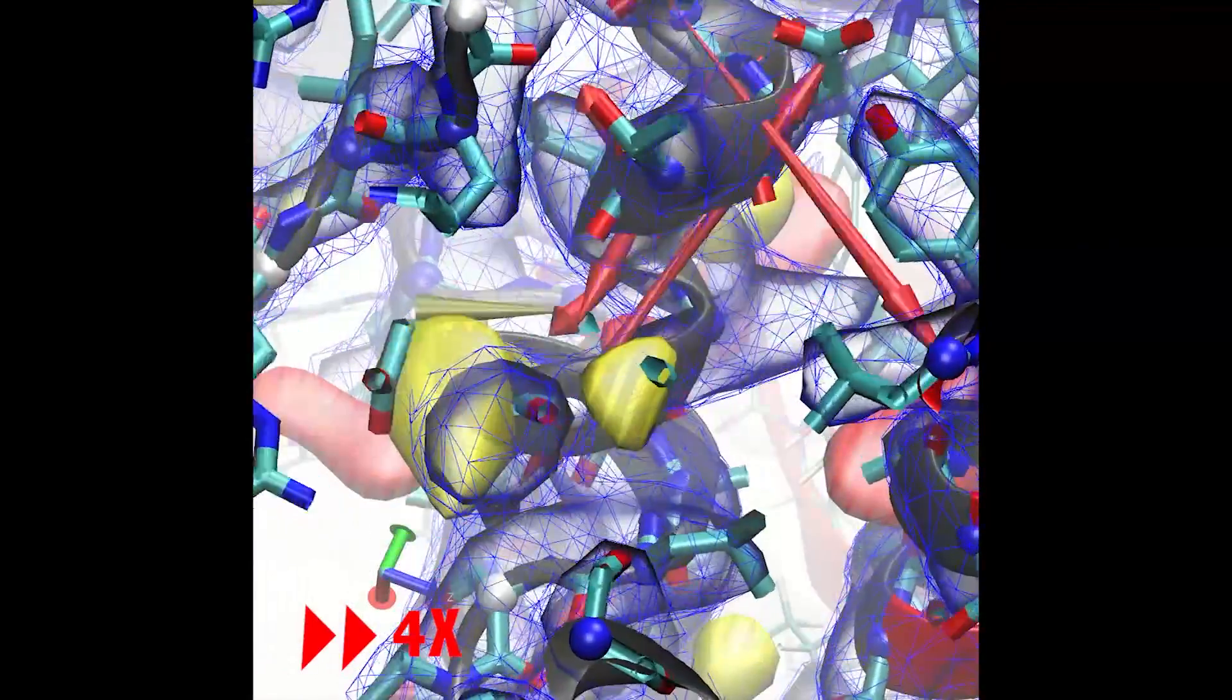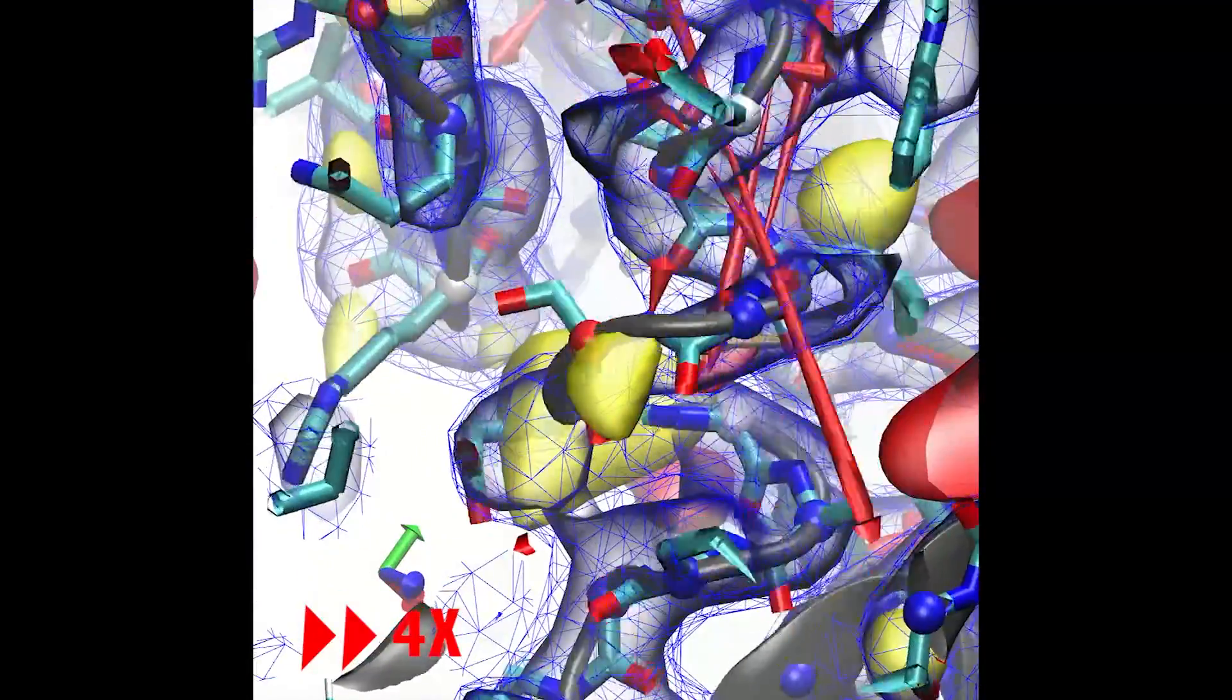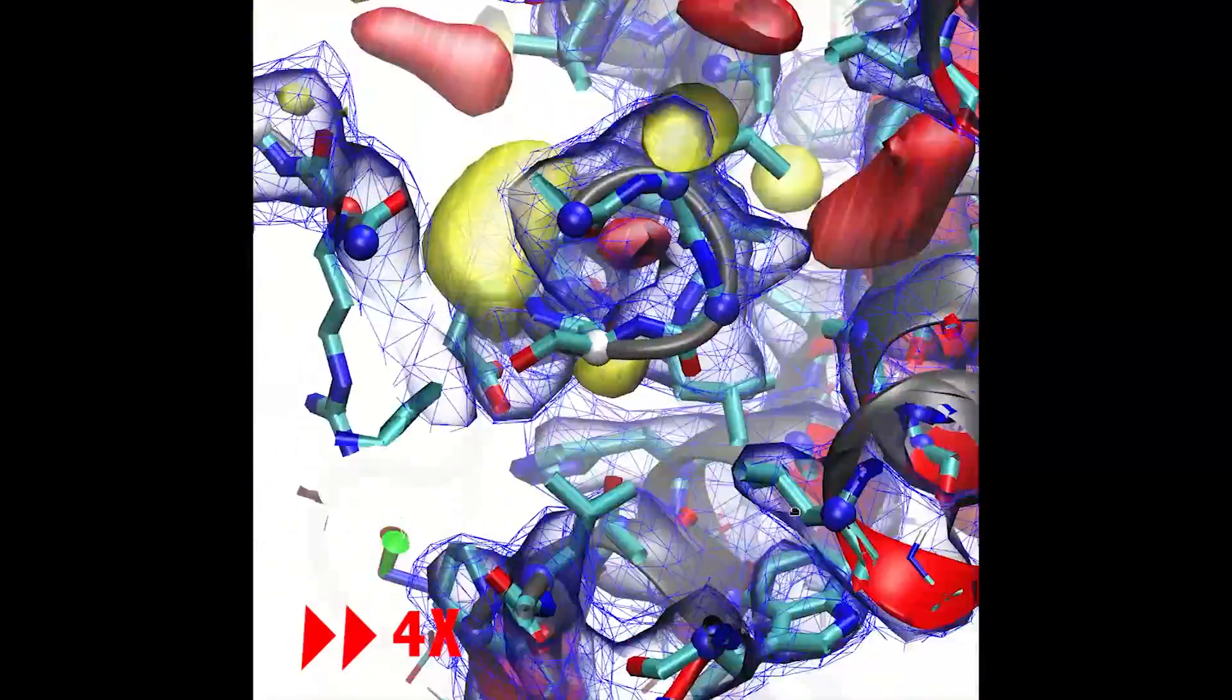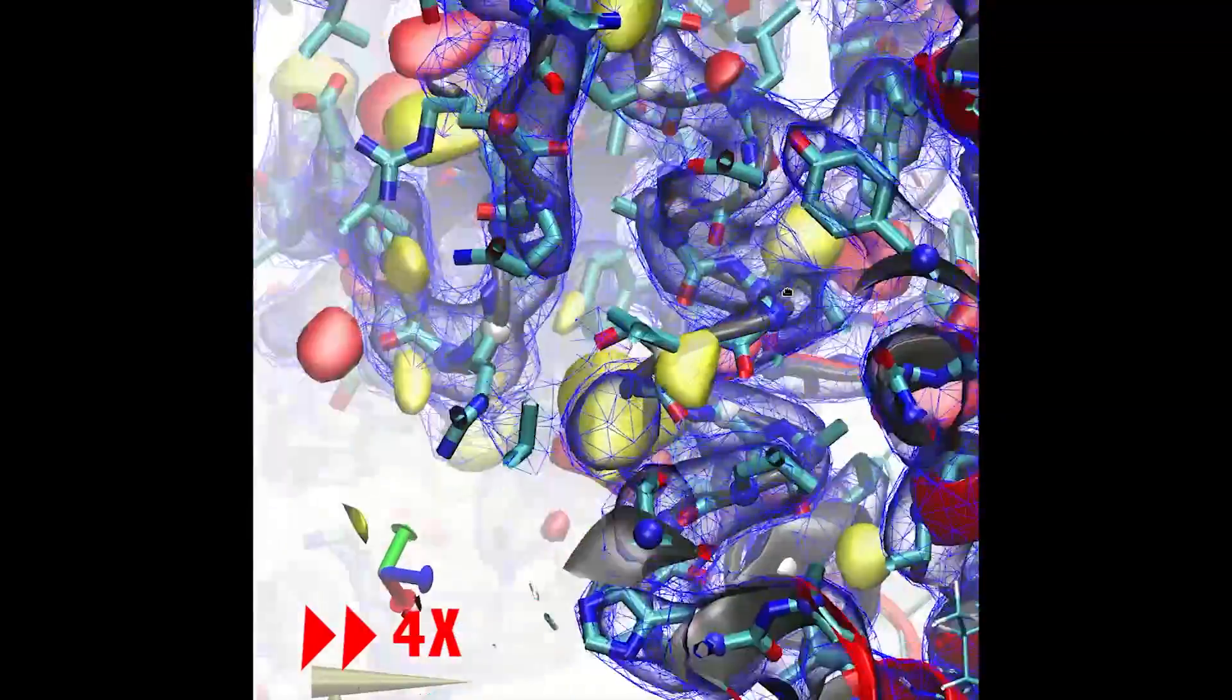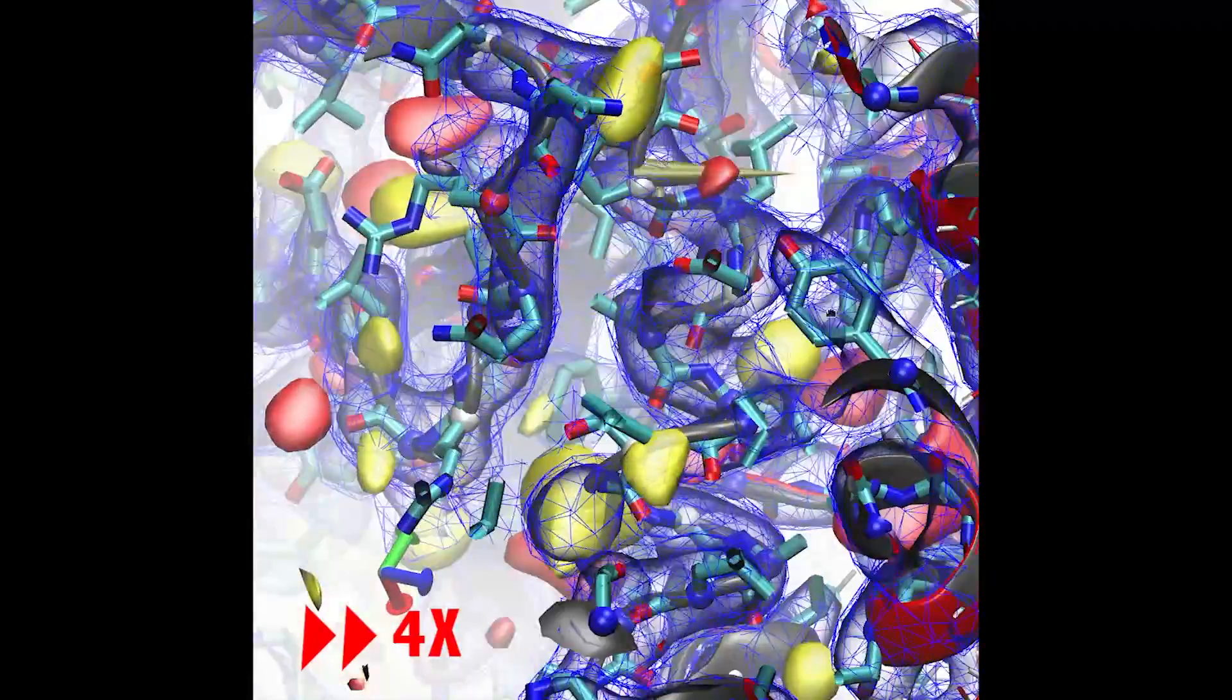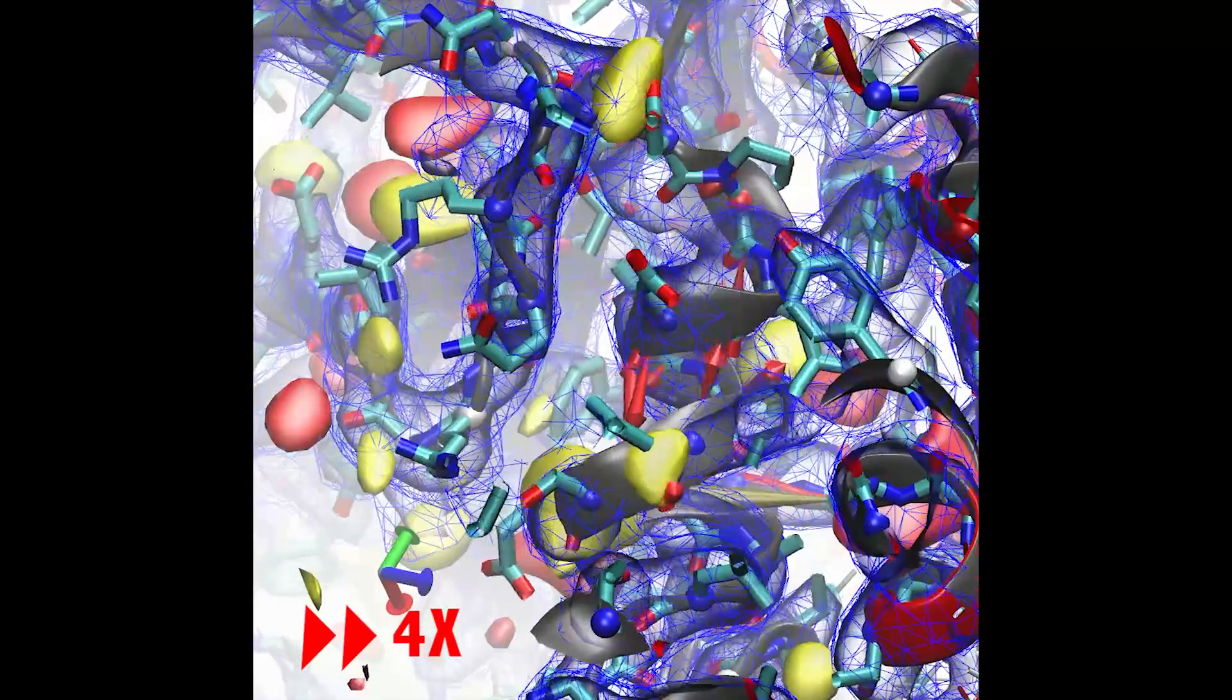As before, these forces will remain active until disabled, allowing me to focus on interactively adjusting that C terminal region. Note that chirality and peptide bond geometry are restrained to natural states and the surroundings are fixed in space, so no matter how aggressively I pull I can't make too much of a mess.